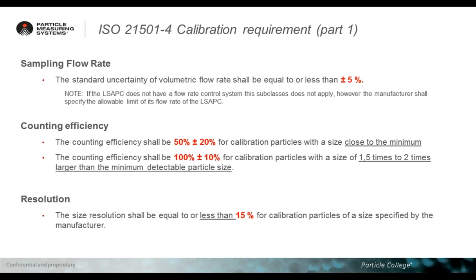Let's start with the main requirements of the calibration standard. The reason why I want to list them is to make sure you look for them anytime you read your calibration certificate. So make sure everything I'm listing here is reported by your calibration service center.